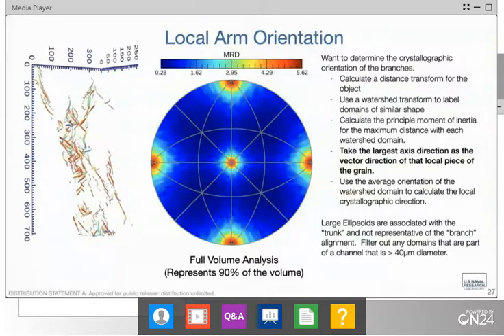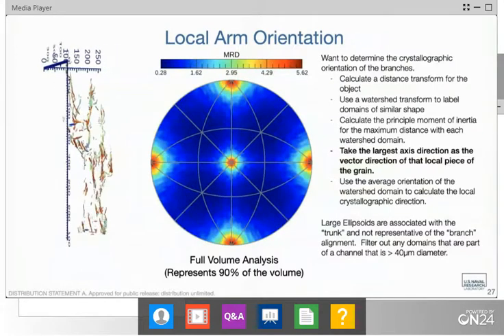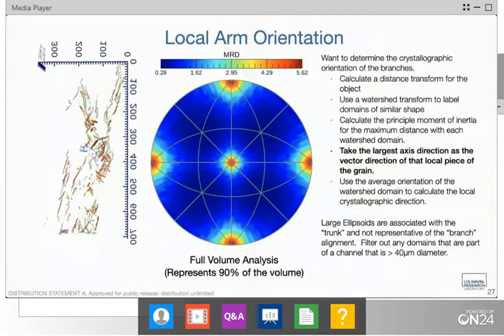First question. Can the polishing with fiducial marks really be called simple, as you need to renew the fiducial marks for every few slices or so? That's a very valid point.